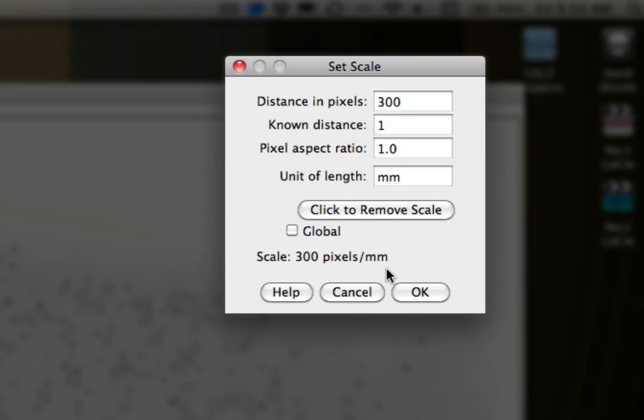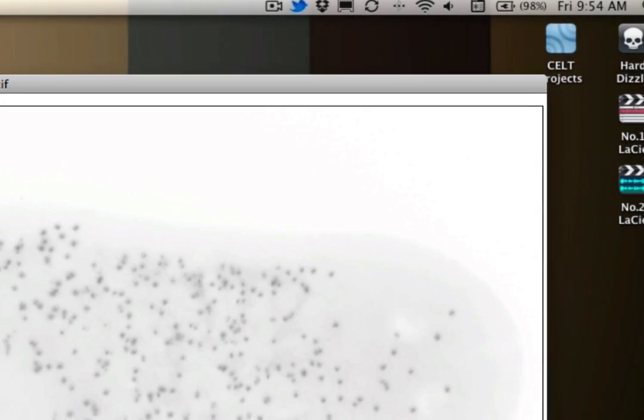You can see this gives me a scale of 300 pixels per millimeter. That's important because once we use the actual analytic measure tool, it's going to use that as a baseline for giving us a number of units. So I'll say OK here.